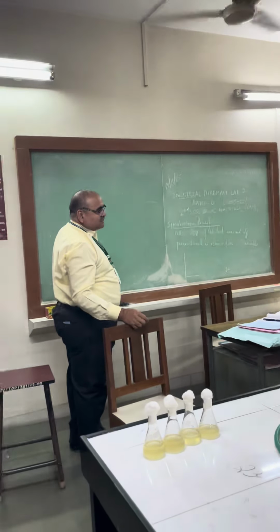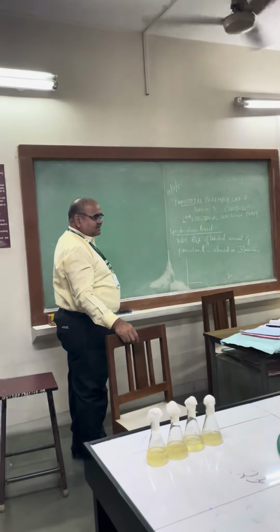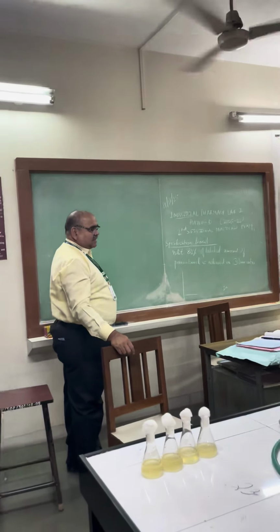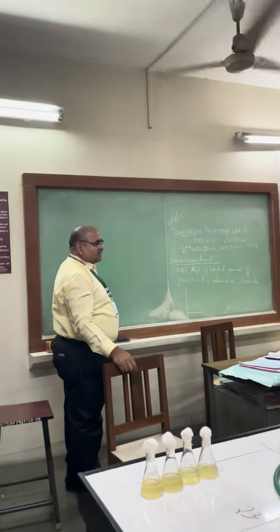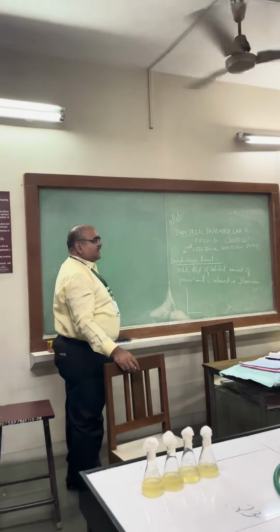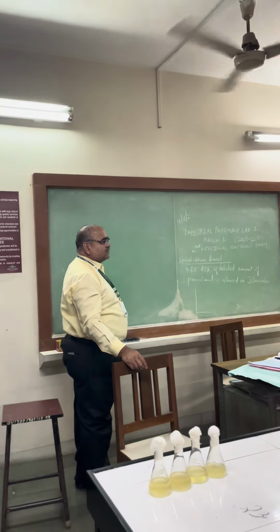Second requirement is sterile starch agar petri plate. Then third requirement is dilute iodine solution.